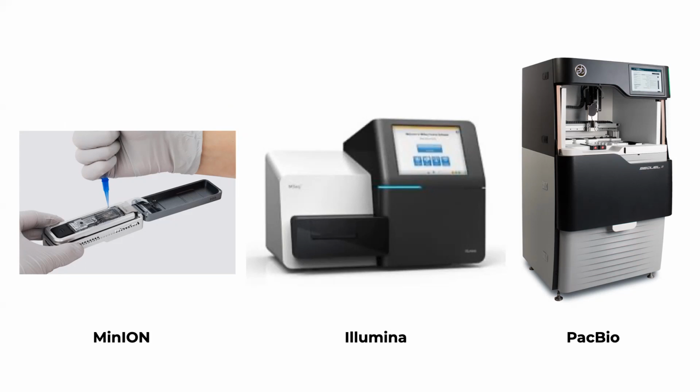So what is important to understand about the different technologies listed here is the length of the read, right? So the size that they can read, yeah, that's correct. When we look at these different sequencers, they can produce longer or shorter reads. But also the reliability of those reads is another factor that we should consider. For example, MinION produces fast and cheap longer reads.